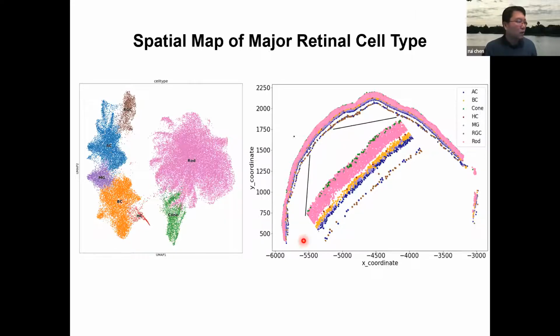You can also see a pattern in the inner nuclear layer, where the top layer is mostly bipolar cells and the amacrine cells are more at the bottom half of the inner nuclear layer. The RGC, which is the brown, is in the RGC layer. You can see some blue, actually displaced amacrine cells, in that one.